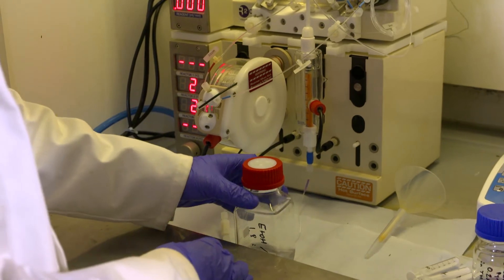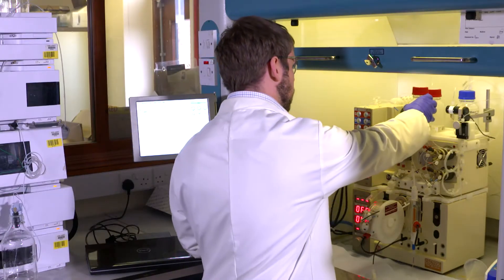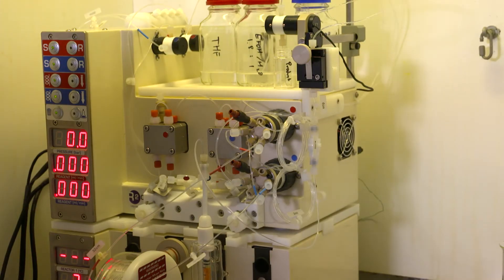Now the column is back on the system and I need to add the other system solvents which are going to combine together in the preheater. Now I'm ready to load my reagents onto the reactor.